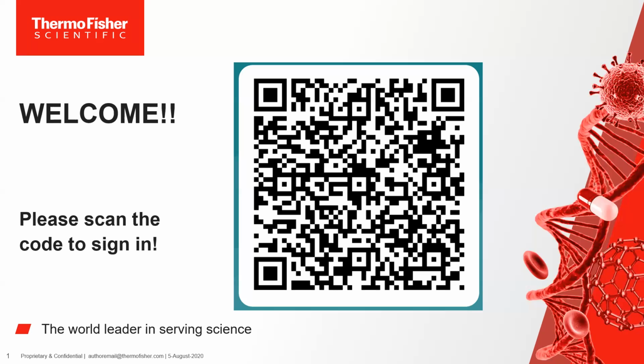So we have a metabolomics heavy conversation today that we wanted to discuss. I'm going to go into the column chemistries that are best used for metabolomics. Craig, like I said, is going to go into an application-specific metabolomics application. And he'll go over the chemistries and what chemistries were used and the instrumentation that was used for it as well.